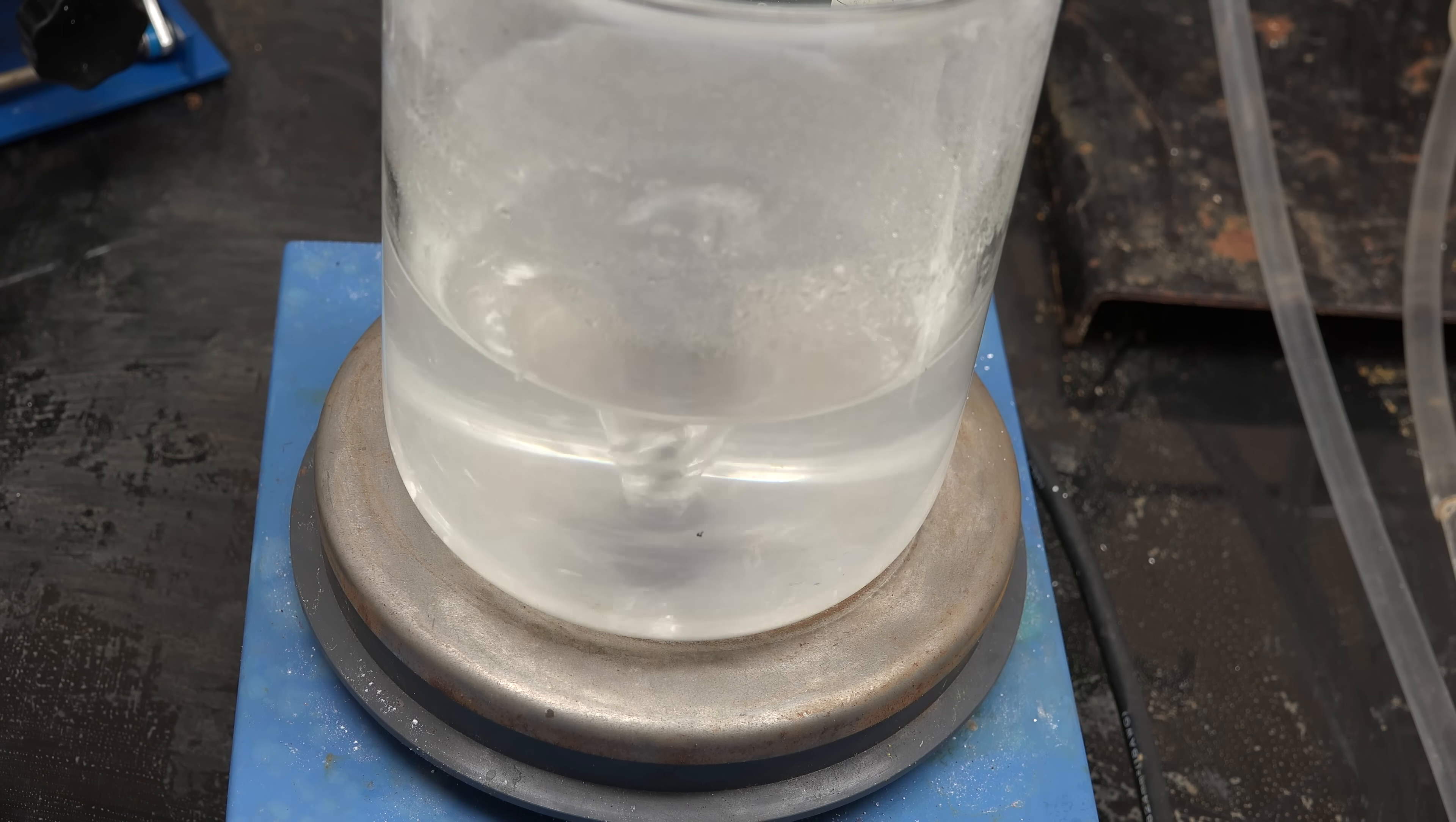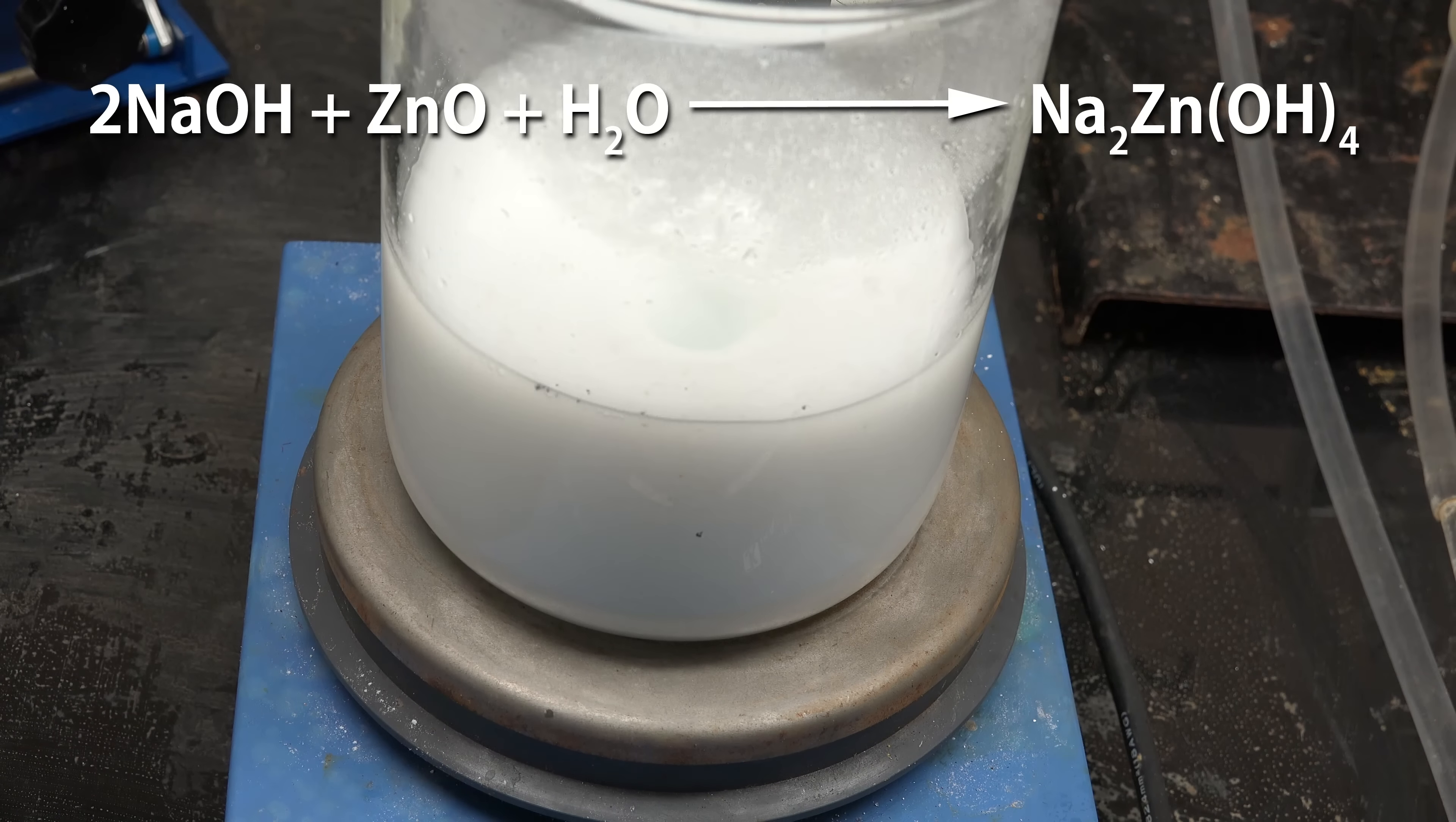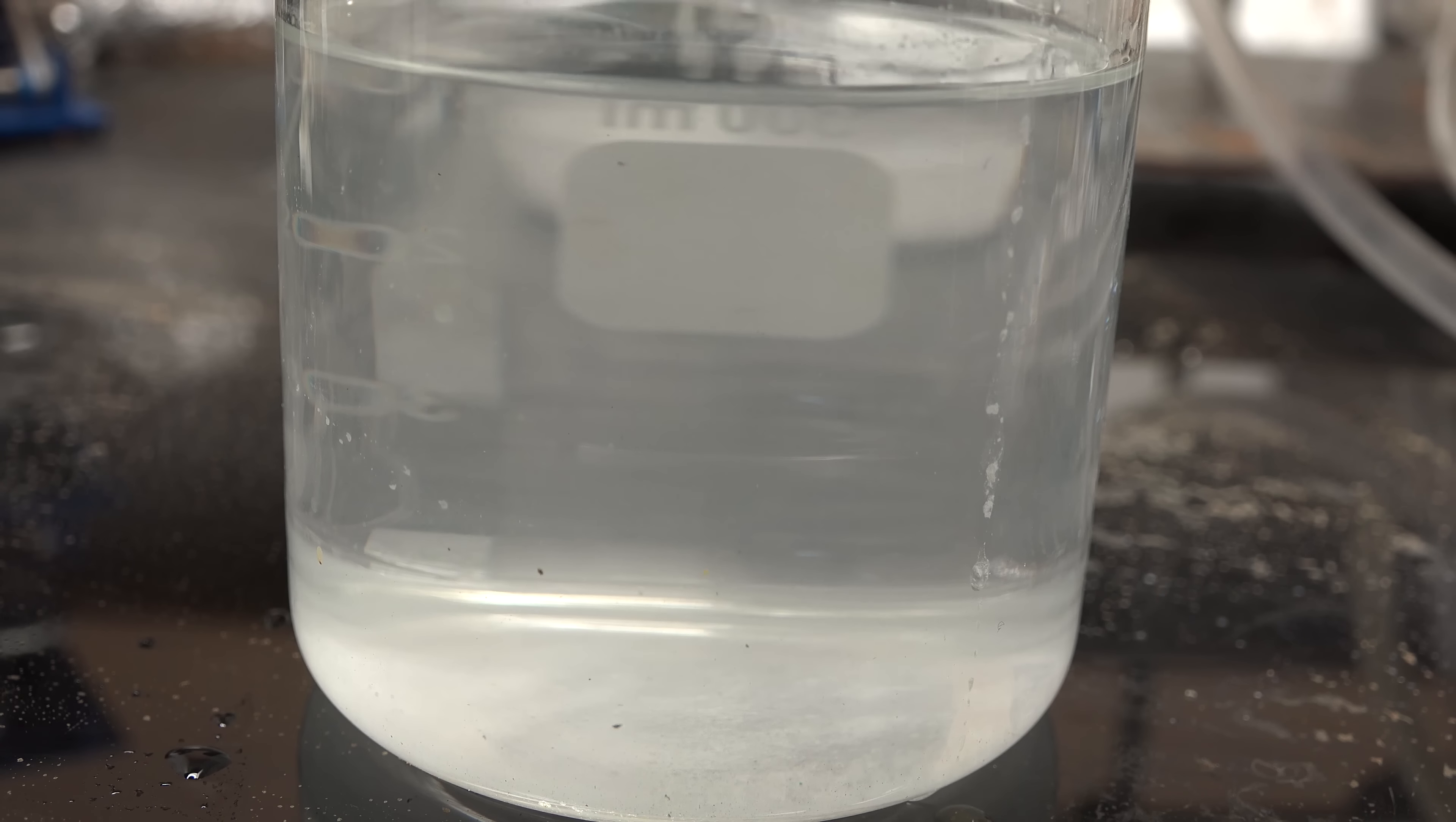Zinc oxide can easily be bought from pottery supply companies and soap making suppliers. What's happening is the zinc oxide is reacting with sodium hydroxide to form sodium zincate. Now I'm going to let the mixture stand overnight to settle and decant off the clear solution. I tried filtering it but my zinc oxide was so fine that it passed right through. Anyway here we are with the decanted clear solution of sodium zincate.